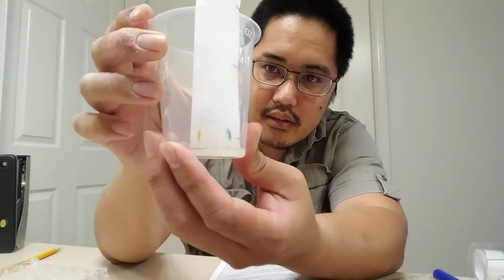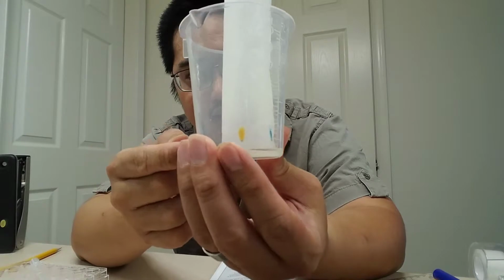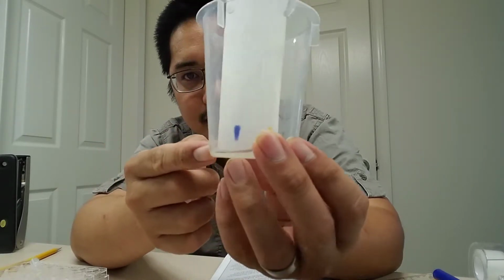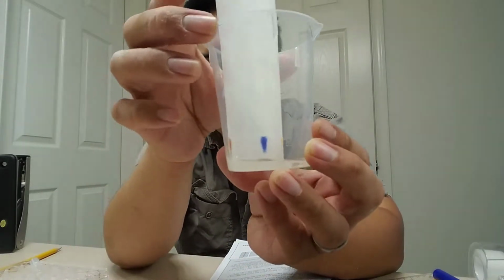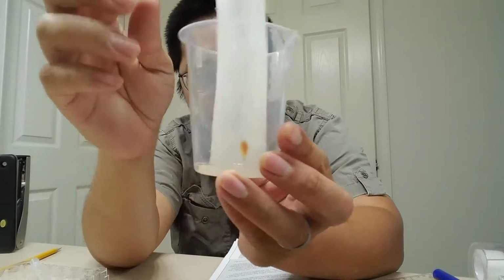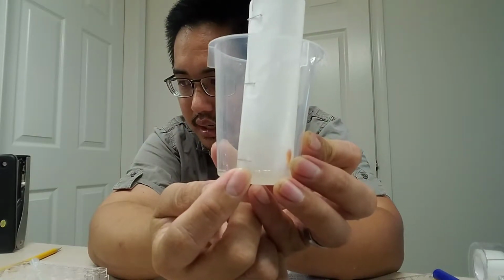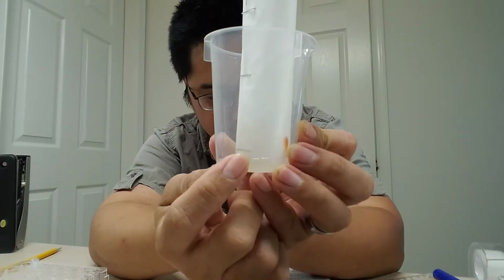Actually, it's starting to work a little bit. You can see, where's the camera? Right there. You can see the water is pulling up this thing, and that pulls up these spots. Now, this first mark right here is right next to my staple, and that's the lead nitrate and the copper nitrate mixture.